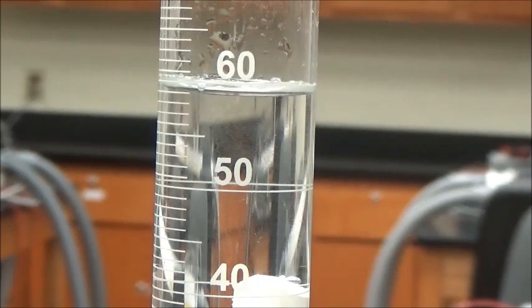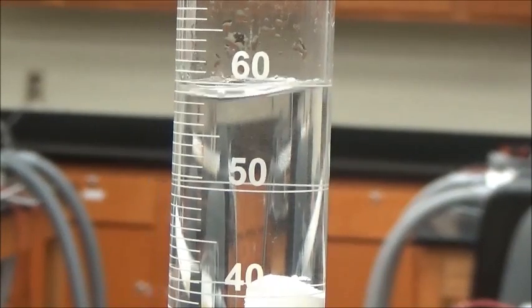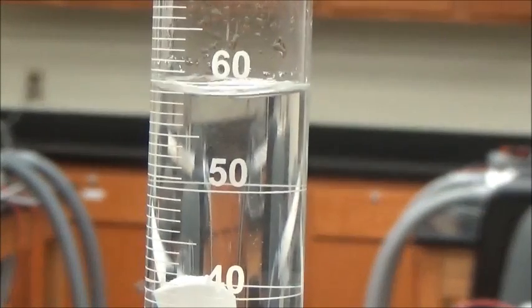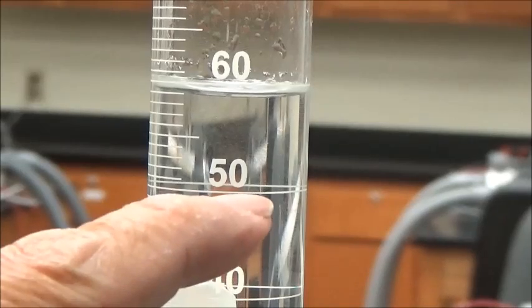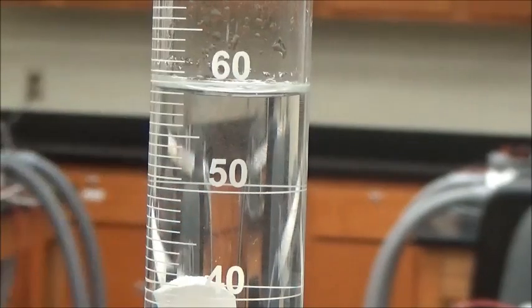The original was 55. It went from 55 to just about 59. Let's just call it that.